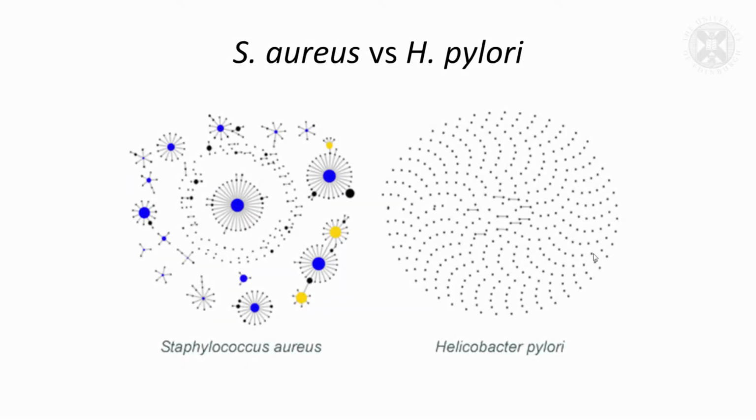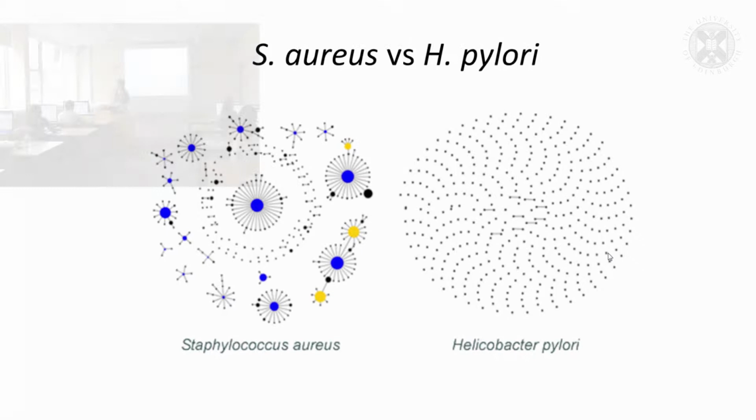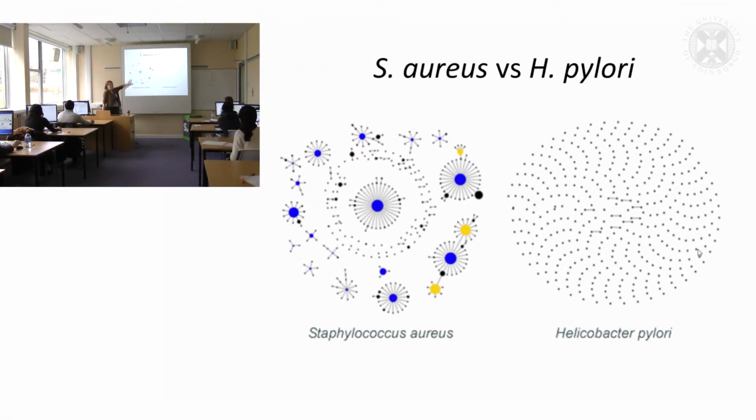And so if you follow those steps, you should get something that looks a bit like this thing at the top. My diagram here is slightly different to yours, but you get these big blobs and then lots of little blobs. So the blobs represent a particular sequence type. So all of these here on the left are the same species of bacteria.